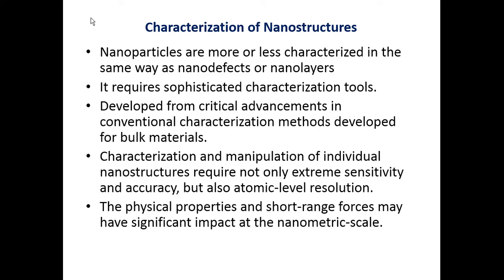So nanoparticles are more or less characterized in the same way as nanodefects or nanolayers. It requires sophisticated characterization tools developed from critical advancements in conventional characterization methods developed for bulk materials. For bulk materials, we have different kinds of tools available to know both the chemical and physical properties.